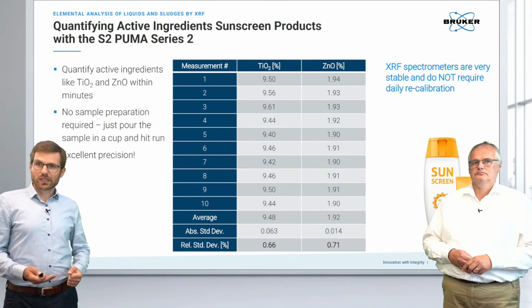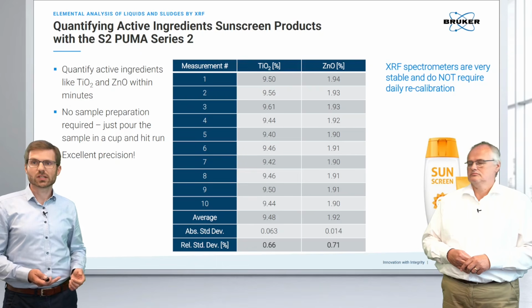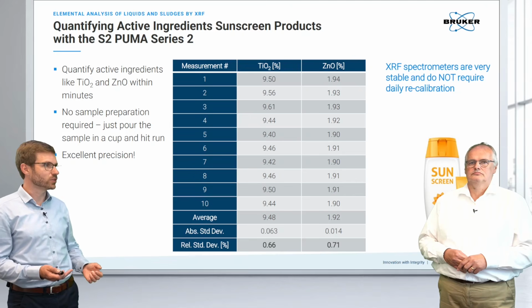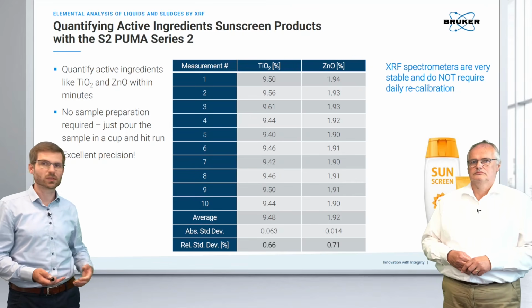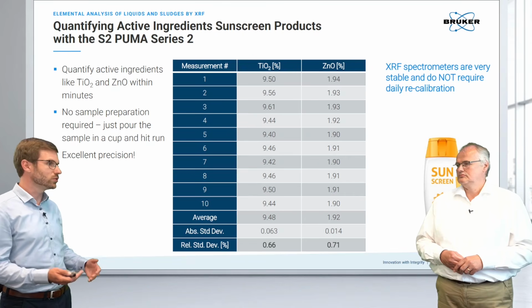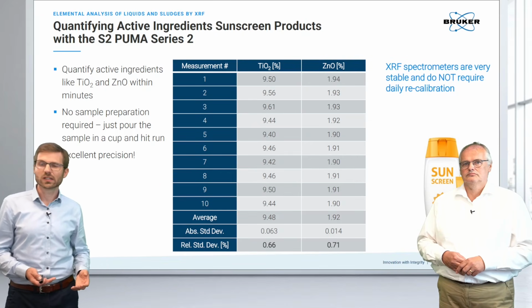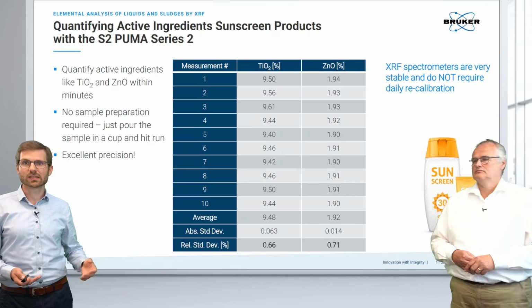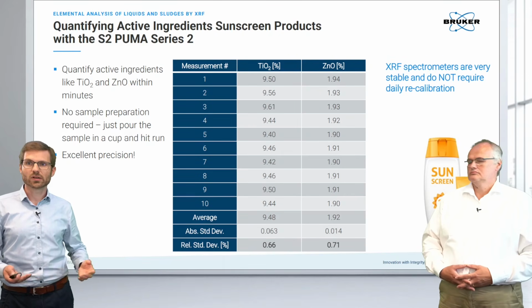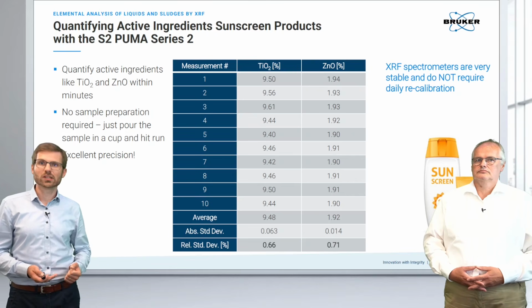When you want to operate more precisely in personal care products, you would again calibrate, especially when it's about appropriate dosing of active ingredients. These active ingredients in sunscreen, for example, can be titanium and zinc oxide. So you want to use them just as much as needed because they can be relatively expensive additives in your material. And here you can measure the titanium and zinc concentration very precisely and accurately with XRF, shown here for an energy dispersive system.